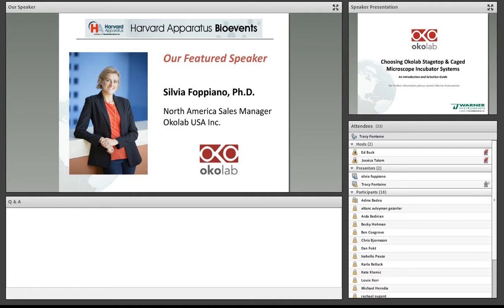Great. So if you were to choose a stage top system, how quickly can you thermocycle? Have you encountered that before?